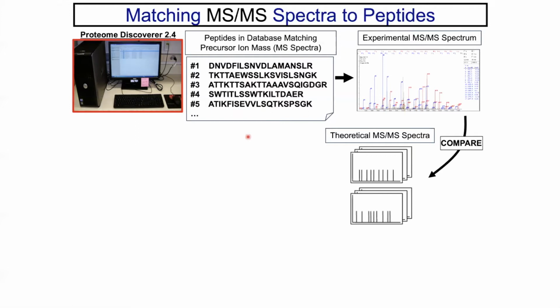In some applications, this is particularly important. For instance, if you're mapping modifications by an enzyme that modifies lysine residues, like an acetyltransferase or a methyltransferase, then you may have a situation where trypsin cleavage might be inhibited by the modification. And so you may want to increase the number of miscleavages that you can have because of your experimental setup or because of the amino acid sequence of your protein.